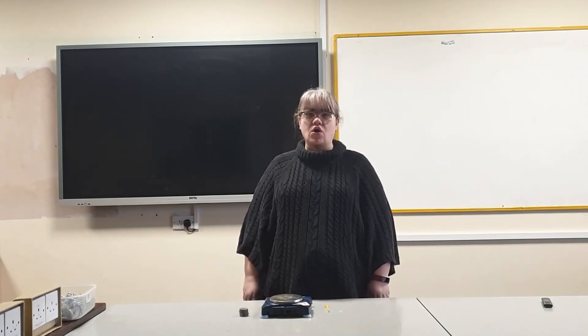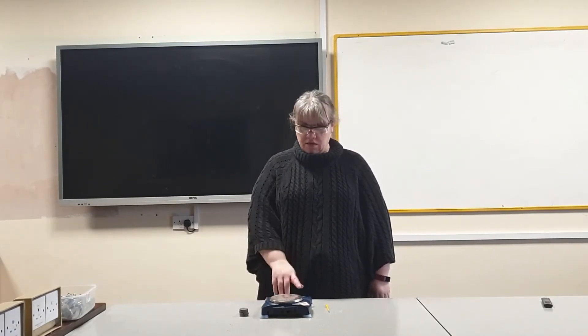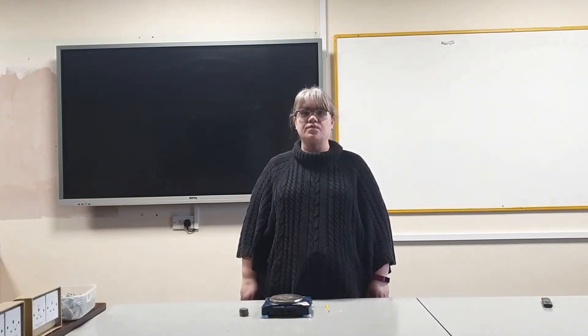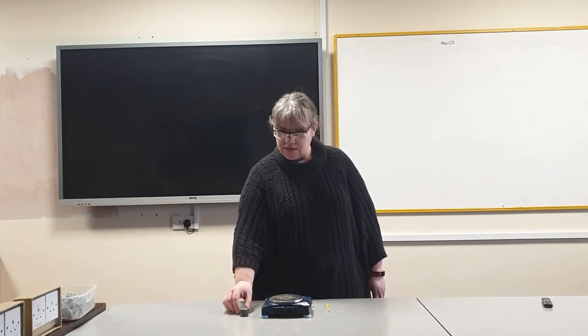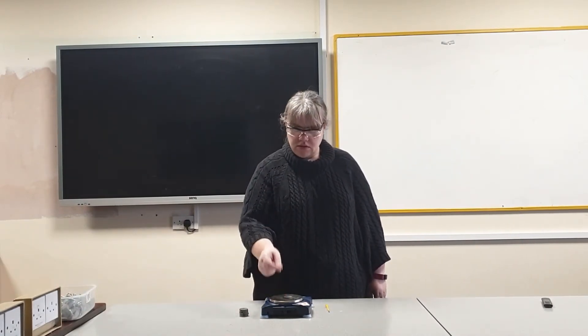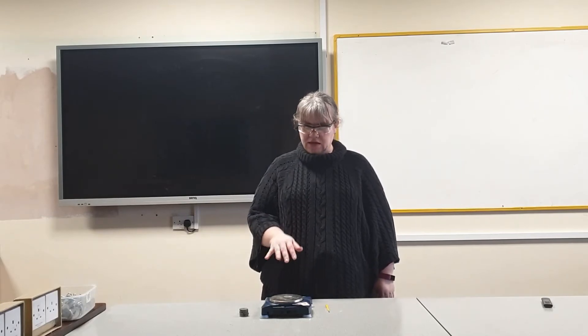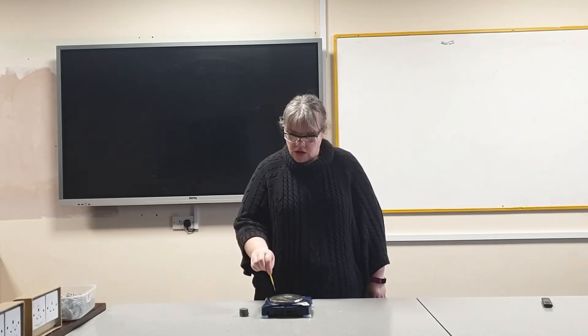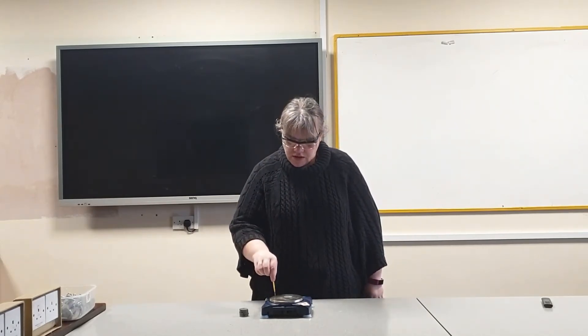Set your balance on a flat surface and press it to zero. Then add your first mass — I'm going to start with 10 grams and see what reading it gives. If your balance has an adjustable screw, use that to adjust the reading so it sits on 10.